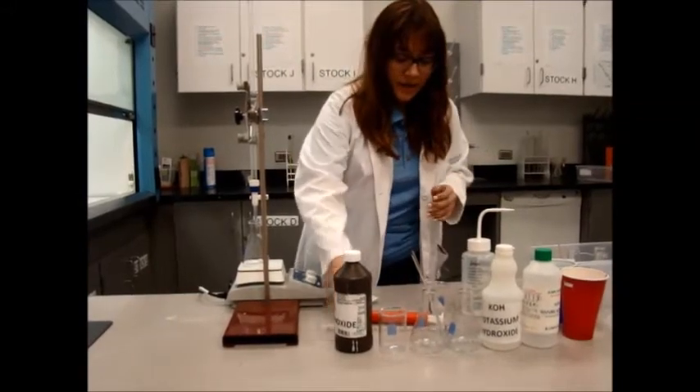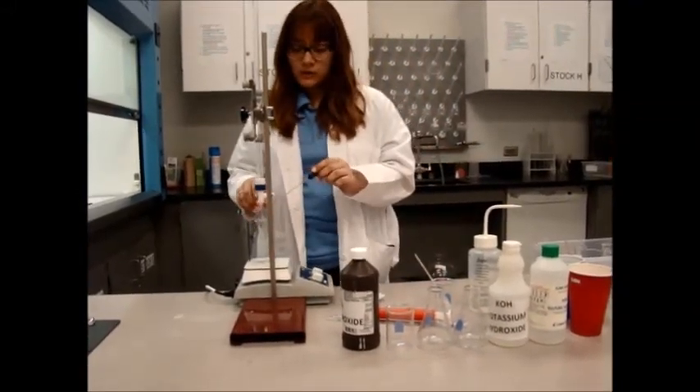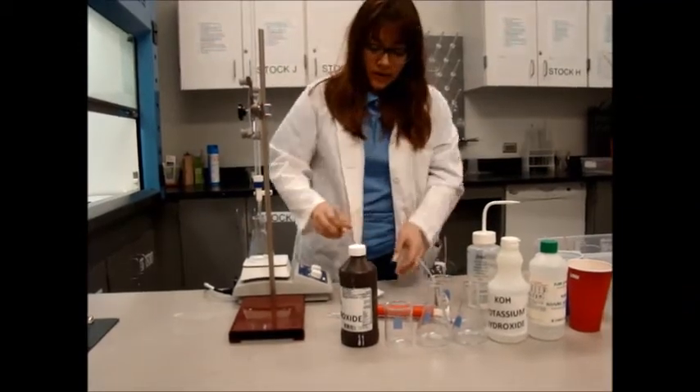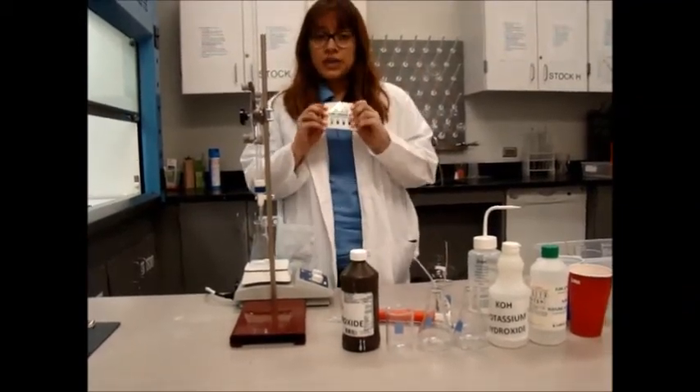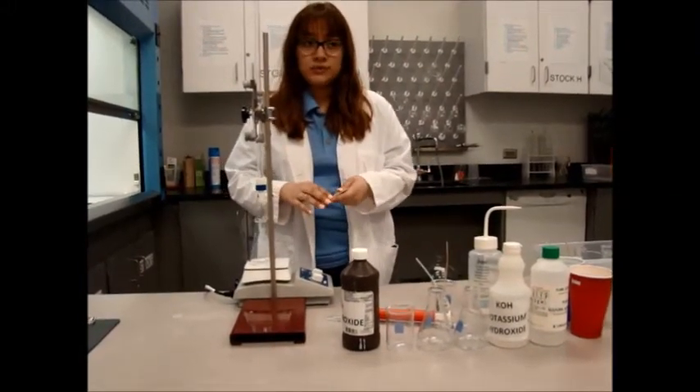Once you are done with that, you are going to take the universal indicator and add two drops to your conical flask. Then use the pH chart given to you to record the initial pH as well as the initial color of the solution.